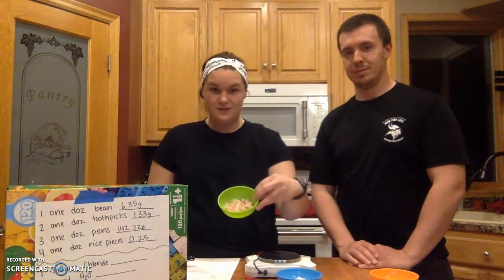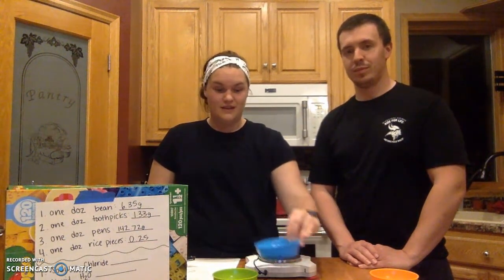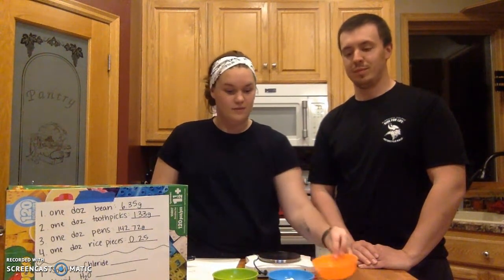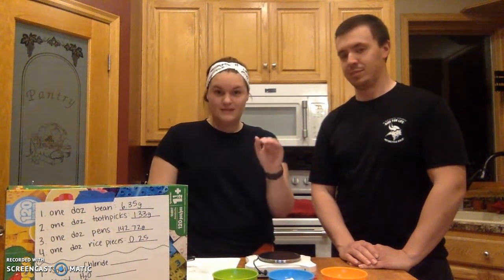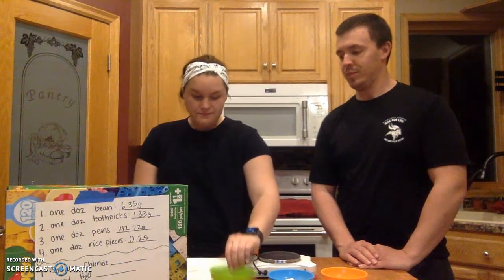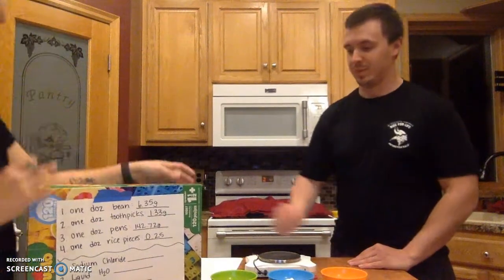Okay, salt is actually rock salt. We have baking soda, and we have just some plain old water in some really high-tech bowls that we borrowed from our son. Okay, and we've already put a bowl on the balance and zeroed it out so that we account for the mass of those bowls. Mr. Strauss is going to put each of these on here, and I'm going to record the mass again. So go ahead and do the salt first.